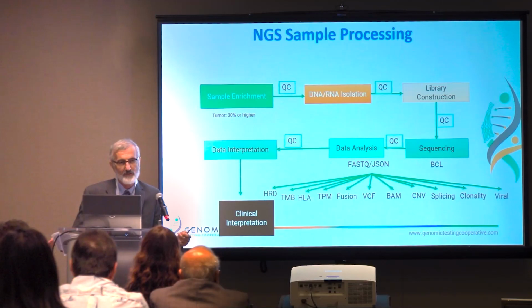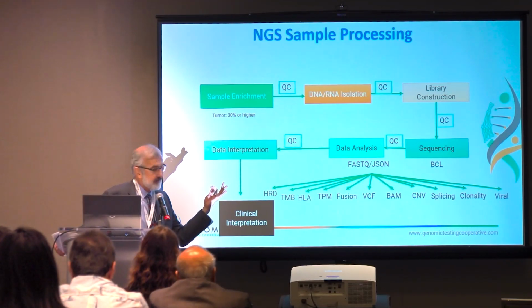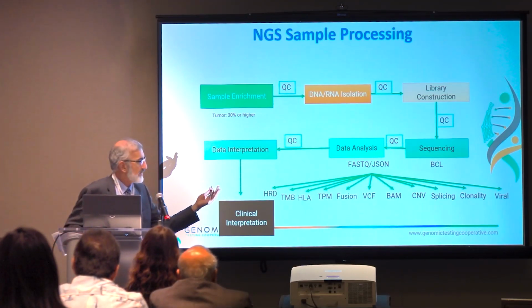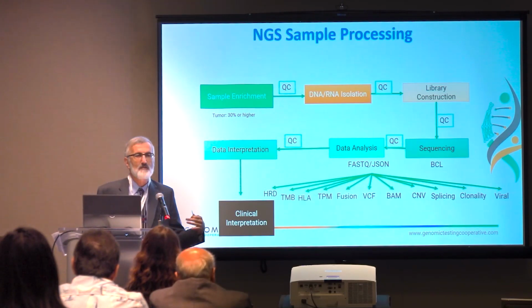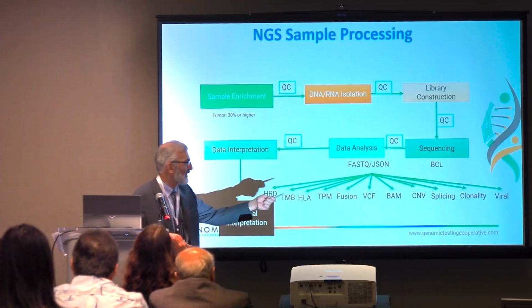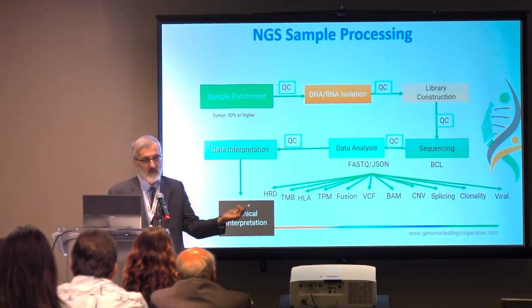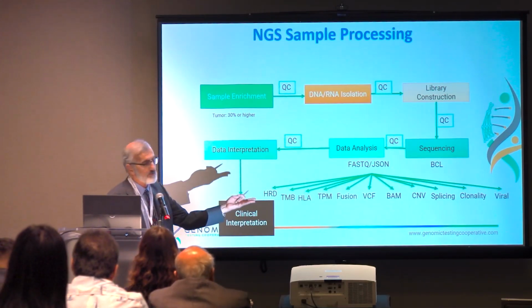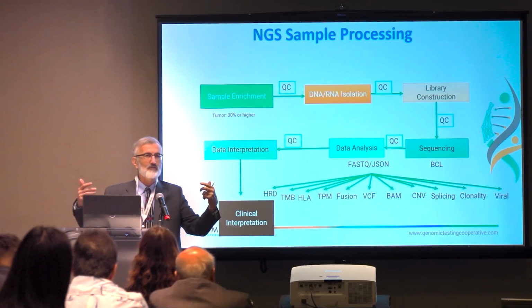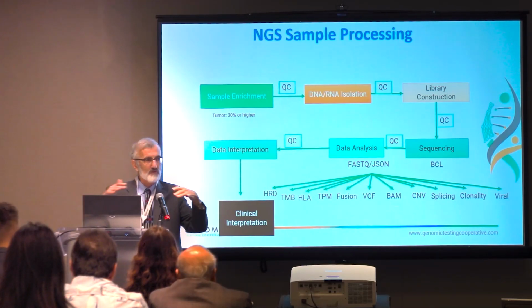The JSON file is a file that is annotated of the FASTQ files. And you generate multiple things using different software. So the first software is actually used to generate the VCF file, which will give you the mutations, the list of mutations in your sample. The BAM file is practically the structured images of your sequence, actually.